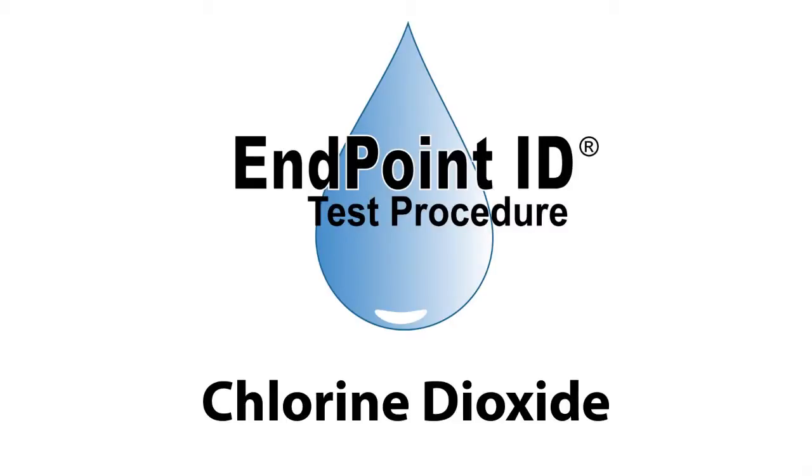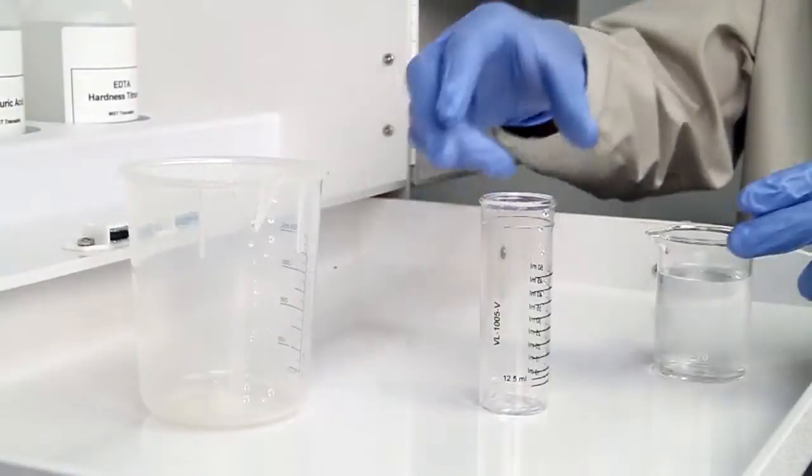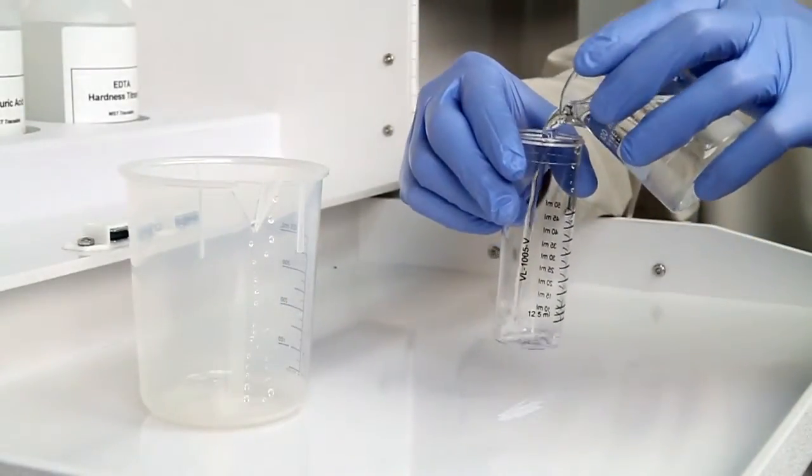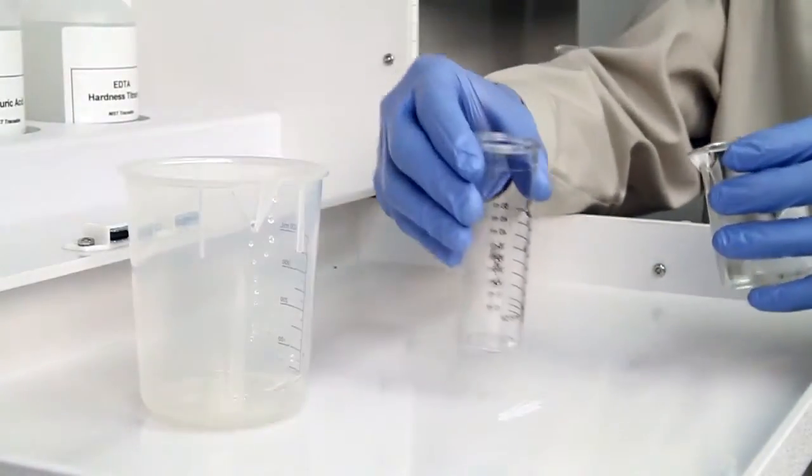This is a demonstration of a Chlorine Dioxide Drop Count Test Kit using EndpointID Procedures. The first step according to the EndpointID procedure is to collect an accurate sample. The smallest change in sample size will lead to inaccurate results.